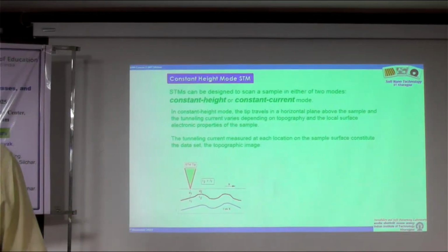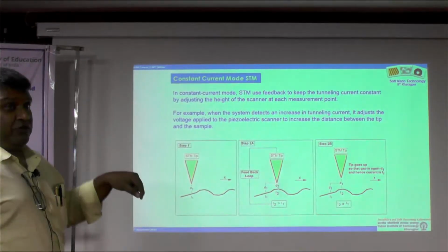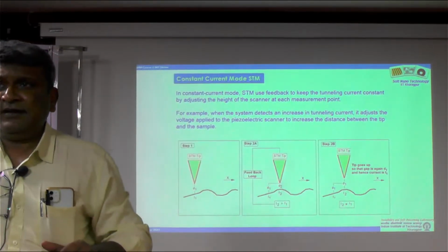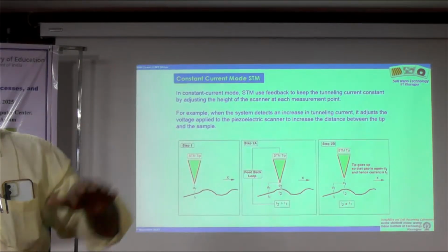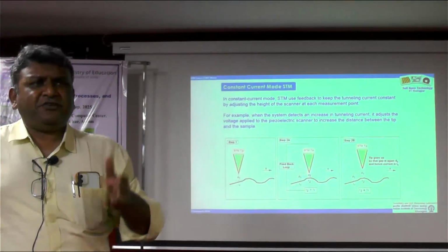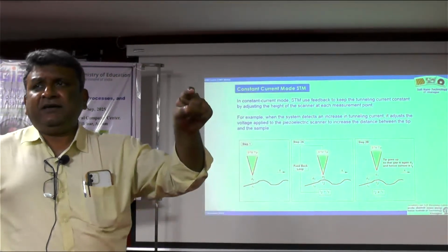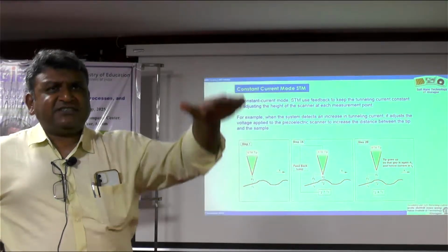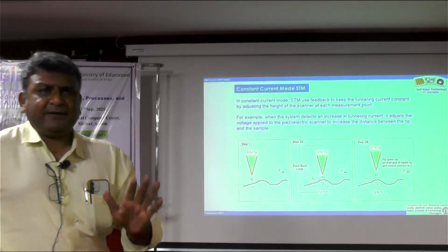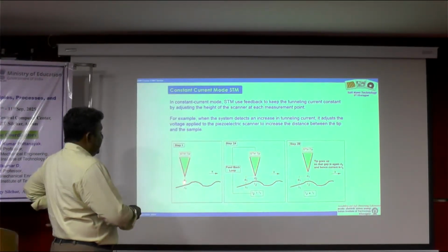So can we improve upon this? And the whole idea eventually led to the addition of a feedback controller. You all know feedback controller, right? The basic idea, for example, a water geyser. So you turn it on, you see the light is on. Then after some time, you see it has attained the cutoff. What does it mean? Whatever is the set point temperature, 45 degrees or whatever, when the coil has become hotter than that, the power supply is switched off. Temperature is allowed to drop. When it again drops below, let's say 44, again it's turned on. Very simple thing.